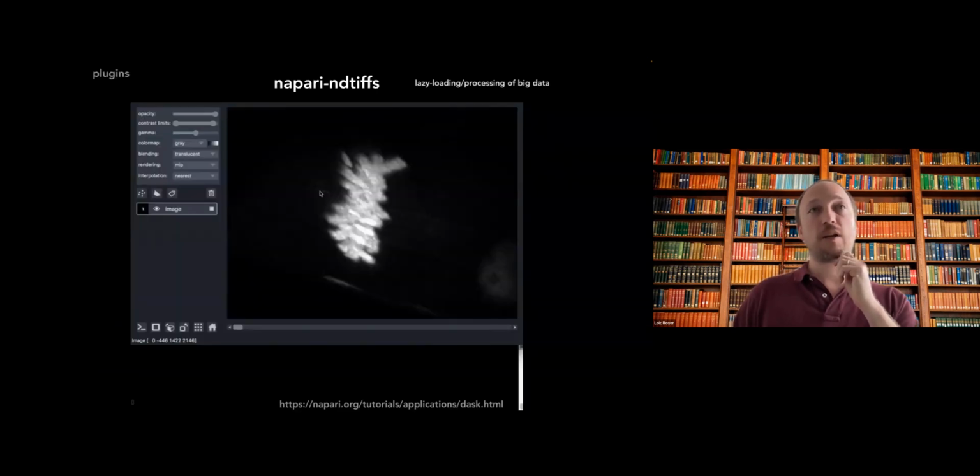So I was already hinting at the plugins, because this is the one thing that CZI has been really helping a lot with their Napari Hub website and other aspects. Part of the idea of Napari was not just to be a viewer, but we also decided we wanted to have the possibility to have a plugin, because this was something that had been successful in other platforms. And so we thought, let's try that.